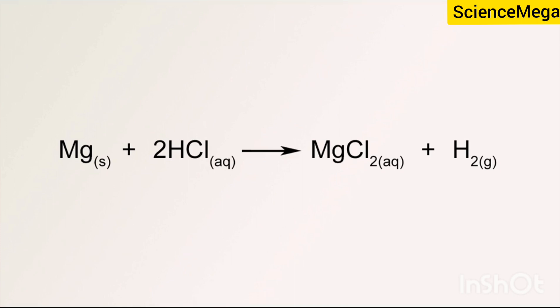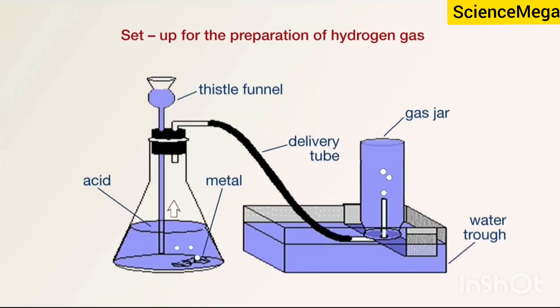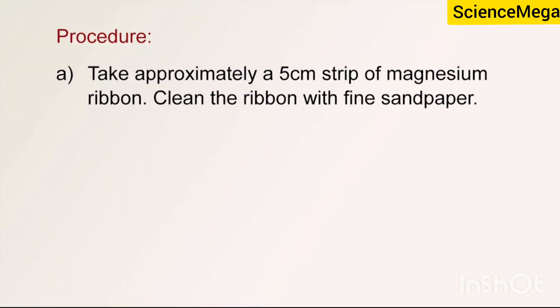The setup for the activity is shown on your screen. First of all, take approximately a 5 centimeter strip of magnesium ribbon. Clean the ribbon with fine sandpaper, then fold the ribbon and place it in the conical flask.